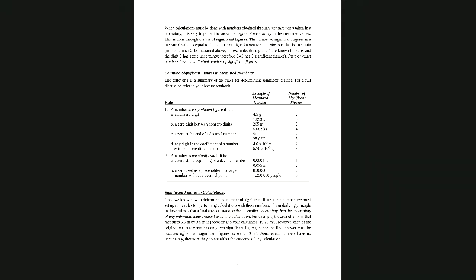Counting of significant figures will be explained to you by your professor in either lab or the lecture. I don't want to make this video too long, so I would leave that part to your professor. And you can also read the document to understand how to count the significant figures.